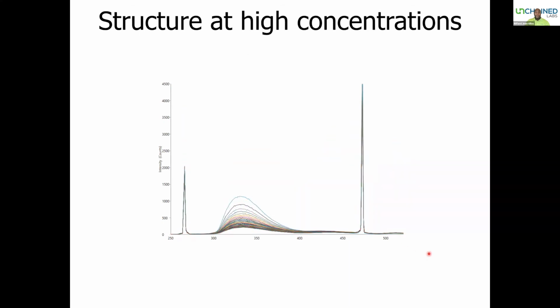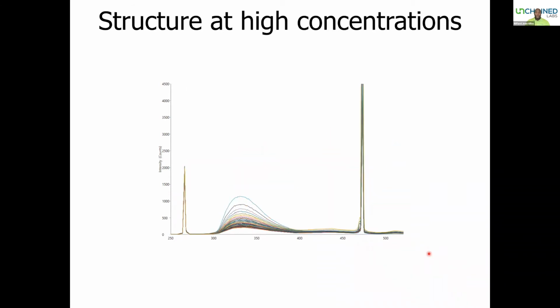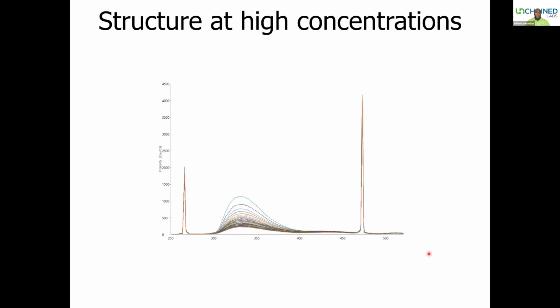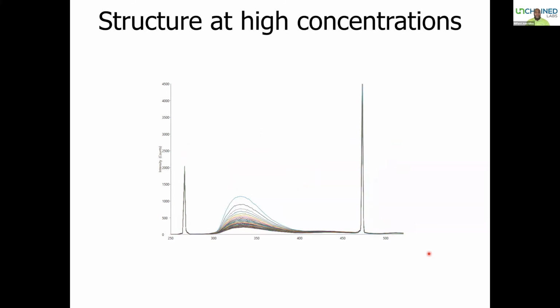So what exactly is taking place? Well, you're getting a lot more scattering, right? Because your sample is actually beginning to aggregate, but you may also have some gel-like formation. You have micron-sized particles that are forming, right? And all of those are going to lead to rather unusual backscatter and Raman types of scattering that can take place. And this is what you're viewing here.